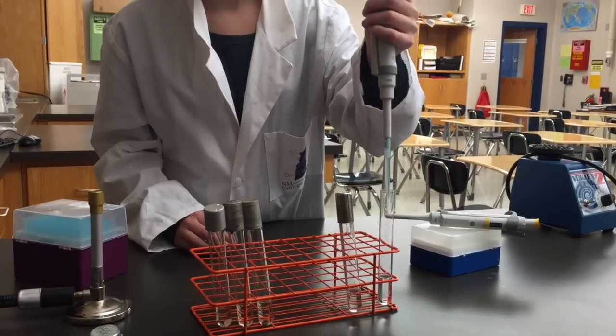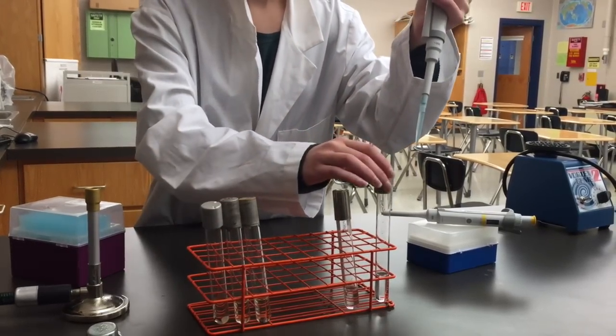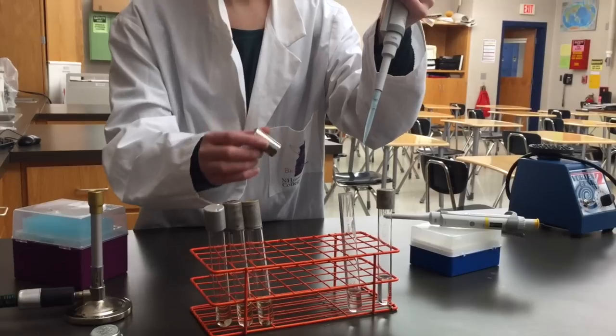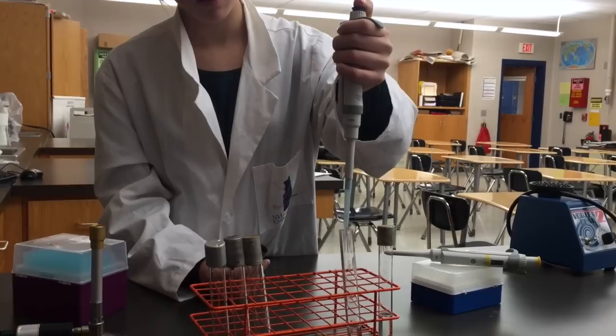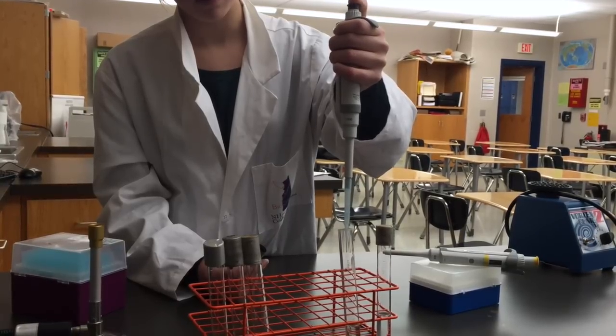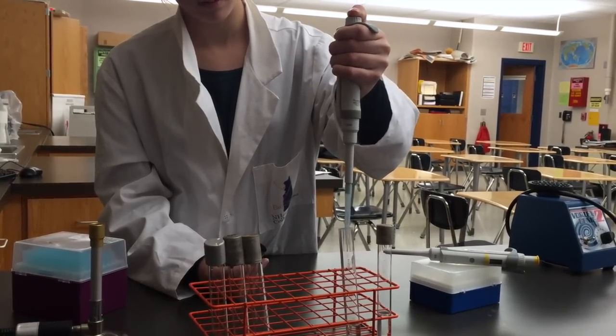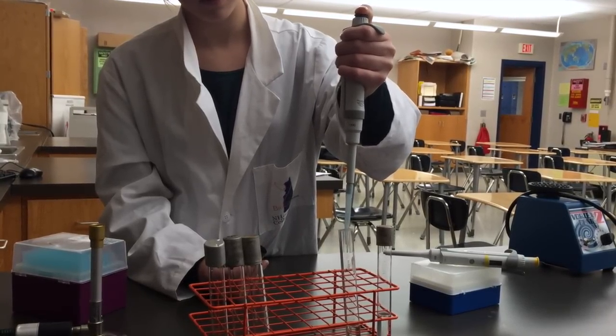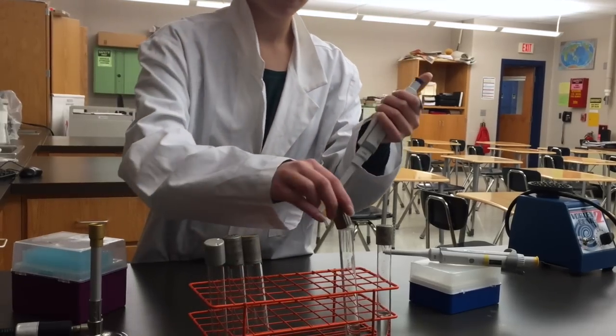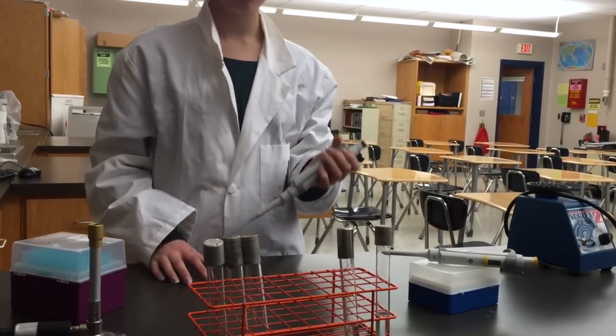Once you have the liquid into the pipette tip and are ready to transfer the volume, you can slowly push down on the control button to the first depression, and then push down further to the second depression. By pushing the control button down to the second depression, we are ensuring that all of the volume that we gathered is being pushed out of the pipette tip and transferred into the new media source.